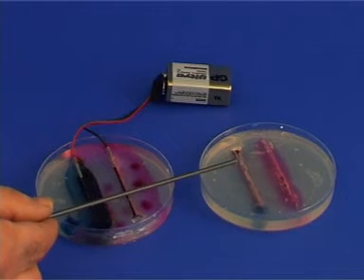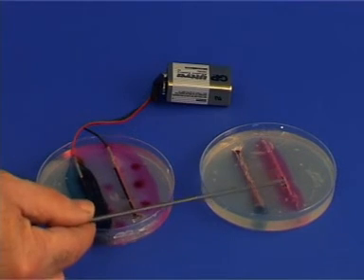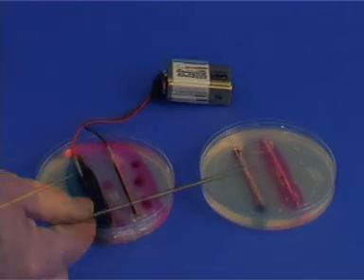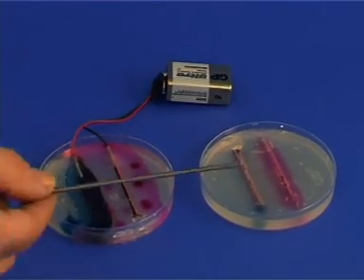The nail on which the magnesium strip was attached develops only a pink color, while on the other nail both blue and pink colors can be observed.